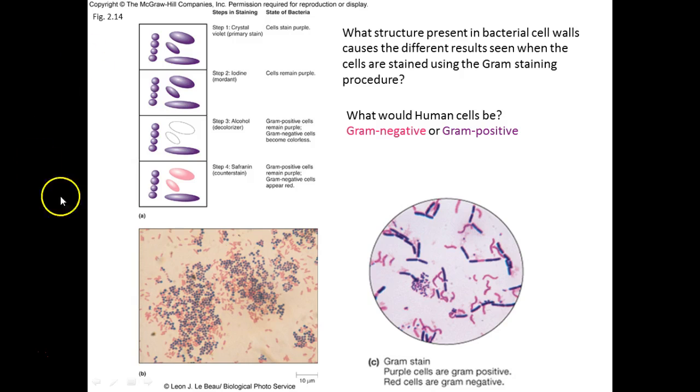So in this case, the ones that retain the color, we call them gram-positive. So they're going to stay purple. Positive and negative does not have anything to do with charge here. It has to do with the result in a test you're running, right? You're running a test. You're doing a Gram stain. Okay, do they stay purple? They're positive, right? So I always remember P for positive. Purple for positive. The ones you decolorize, you're not going to see them if you stop there. They become colorless. Right? We use ethanol in the lab.